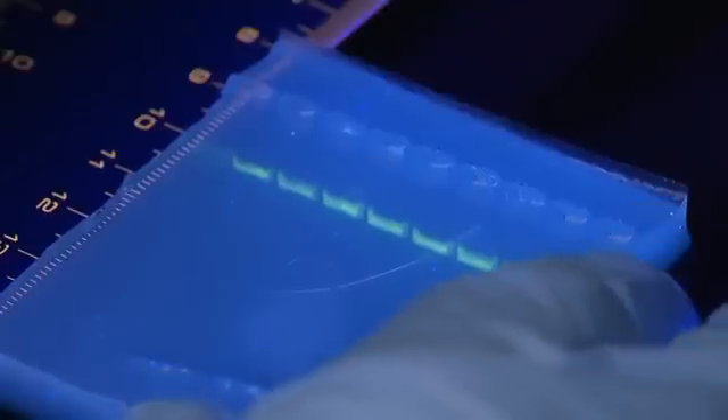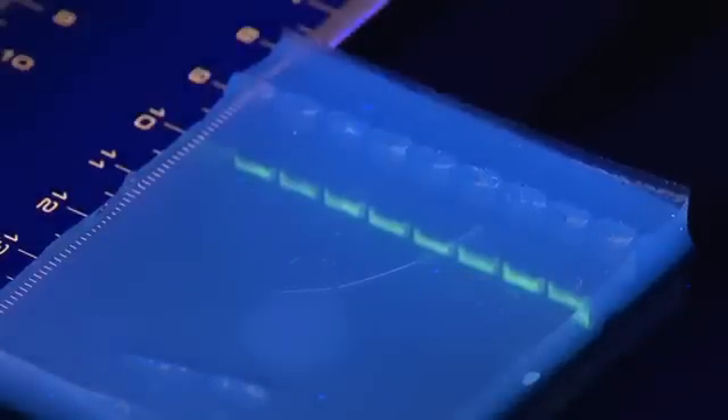The casting and running of agarose gels is an important aspect of molecular biology, allowing quick analysis and occasionally purification of nucleic acids.